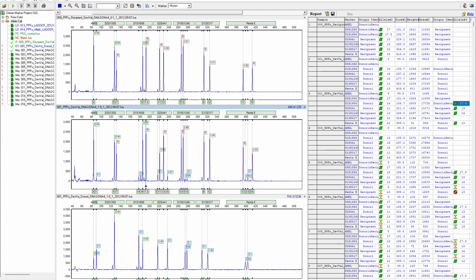In addition, ChimeRMarker uses the genotypes of donor and recipient to automatically label the origin of each allele in the post samples. Each peak has a designation for origin, D for donor, R for recipient, and D/R for peaks that are shared by both the donor and the recipient. These labels are consistently identified in all samples, removing the time-consuming and potentially error-prone step of identifying informative loci manually.